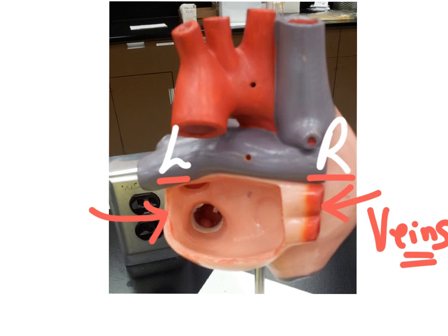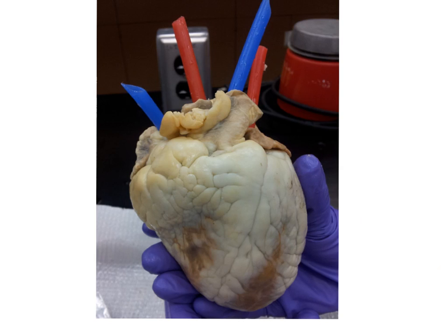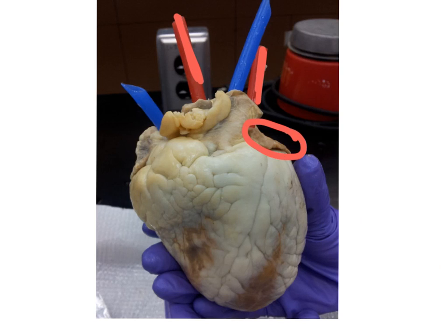So the oxygenated blood comes back right here into the left atria. It is a bit difficult with the sheep heart to determine, of the two vessels, which one is the aorta and which one is the pulmonary vein. If we're looking at this little flap right here — there's one there and one there.